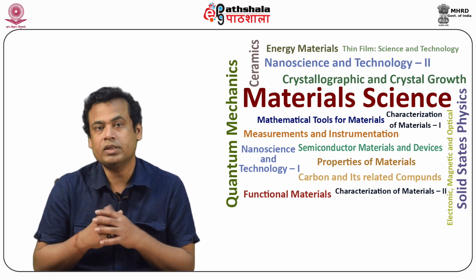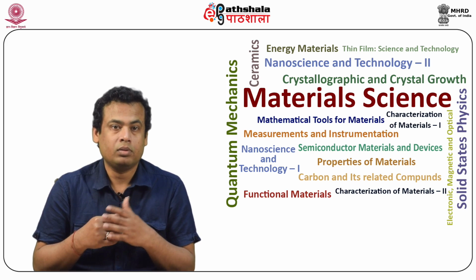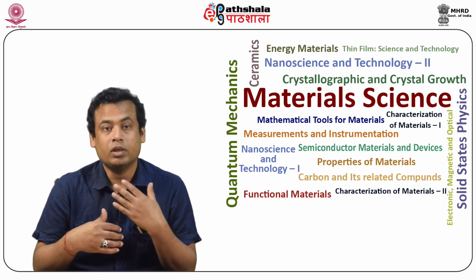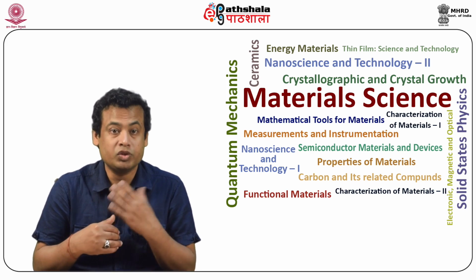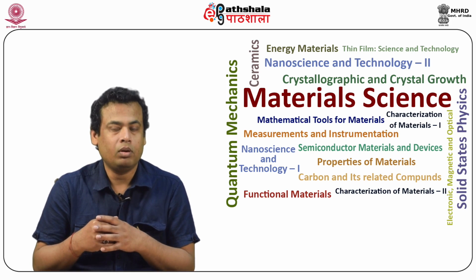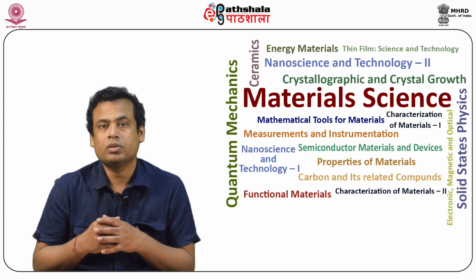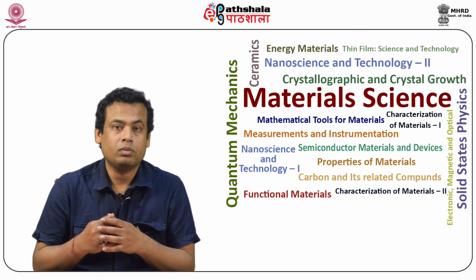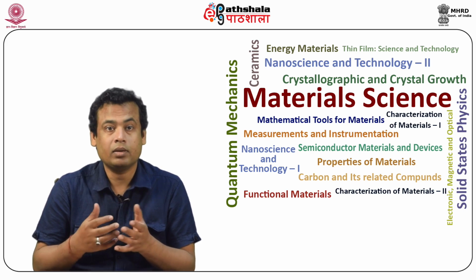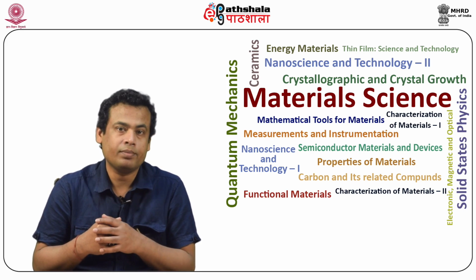Morphology studies the shape, texture, and distribution of materials at a surface and is best evaluated using imaging techniques such as optical microscopy or electron microscopy. These methods can also provide layer thickness using an optical profilometer or by taking an image of a transverse section of the specimen.